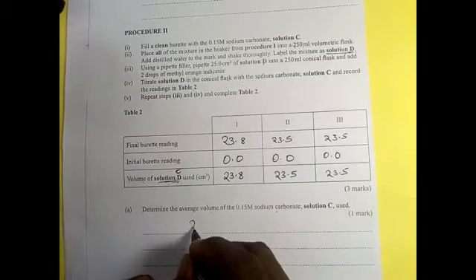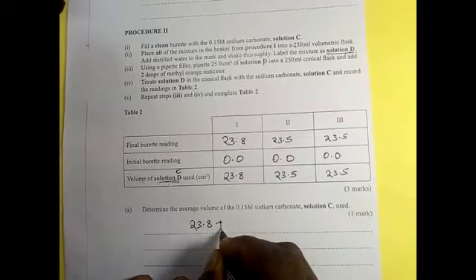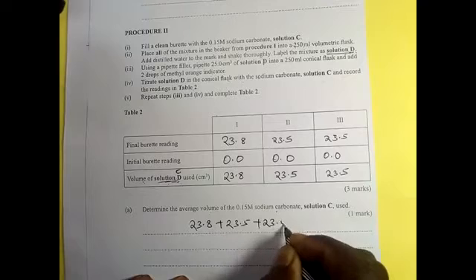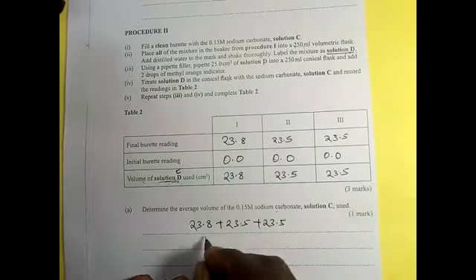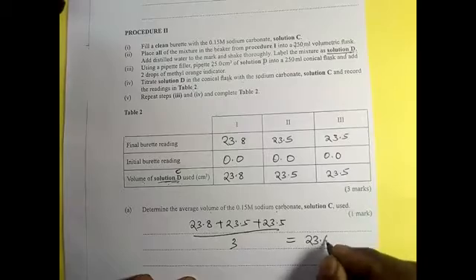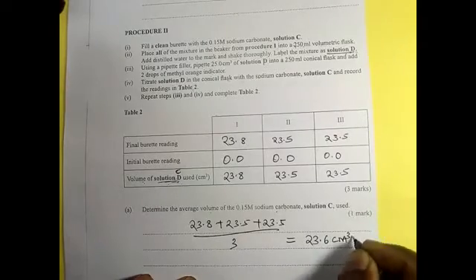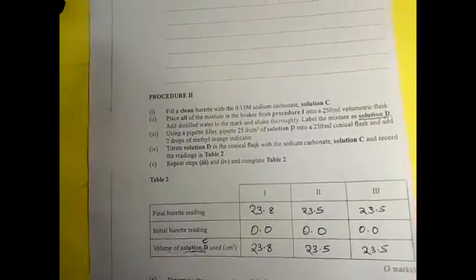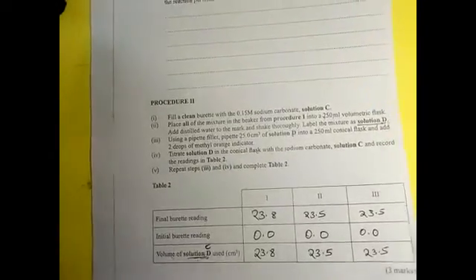So we have used 23.8 plus 23.5 plus 23.5 divided by 3, which will give us 23.6 cm³. Next page.